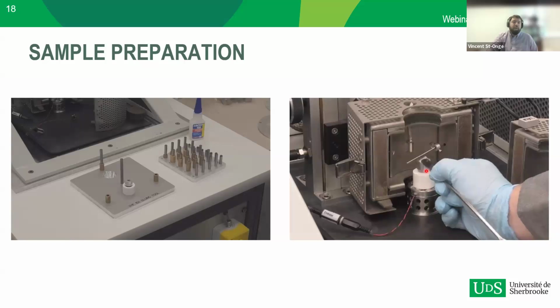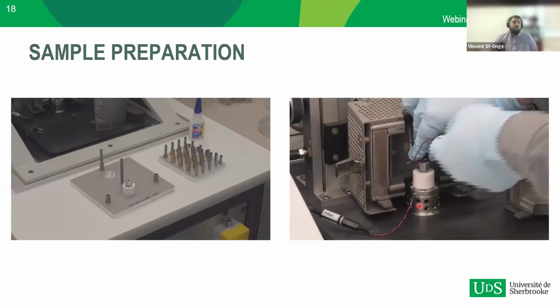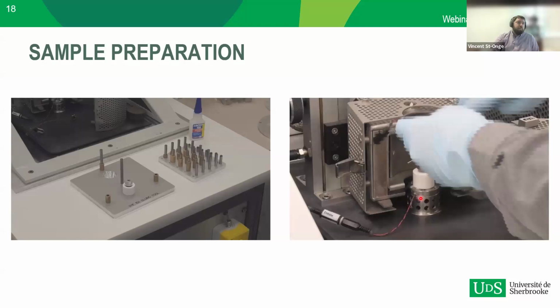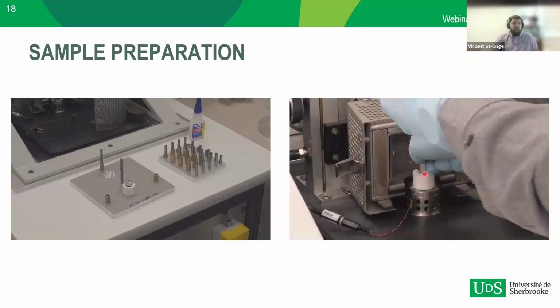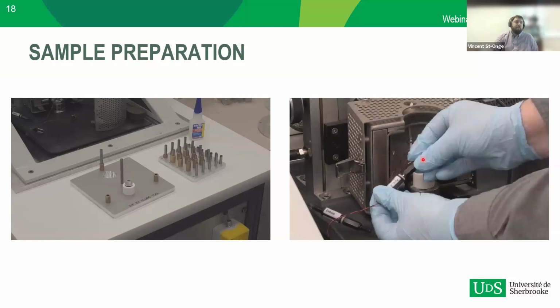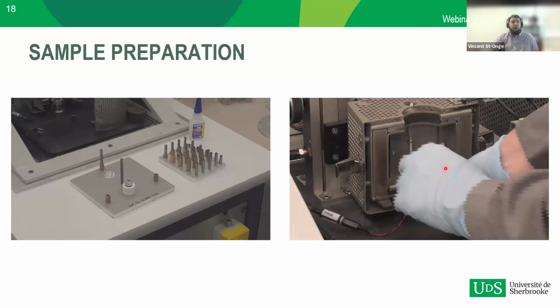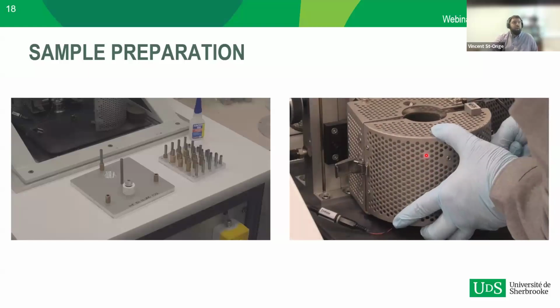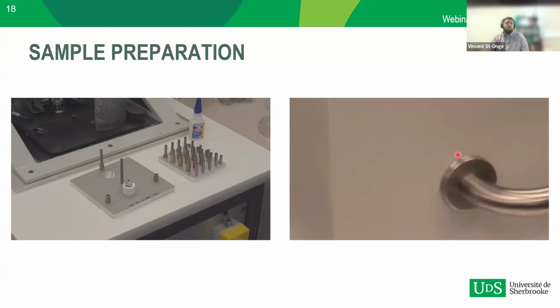And that's actually the deformation that will happen during the measurement. It's going to shake up and down at various frequencies. And what we will actually be measuring is the acceleration from the accelerometer of the base and the acceleration from the accelerometer on the top of the sample, as you can see in this video. It's very important to make sure that the wires are not applying any form of stress on the sample, because it will also change a little bit the measurement. Then you can close the oven, and then we're good to go to run the measurement.